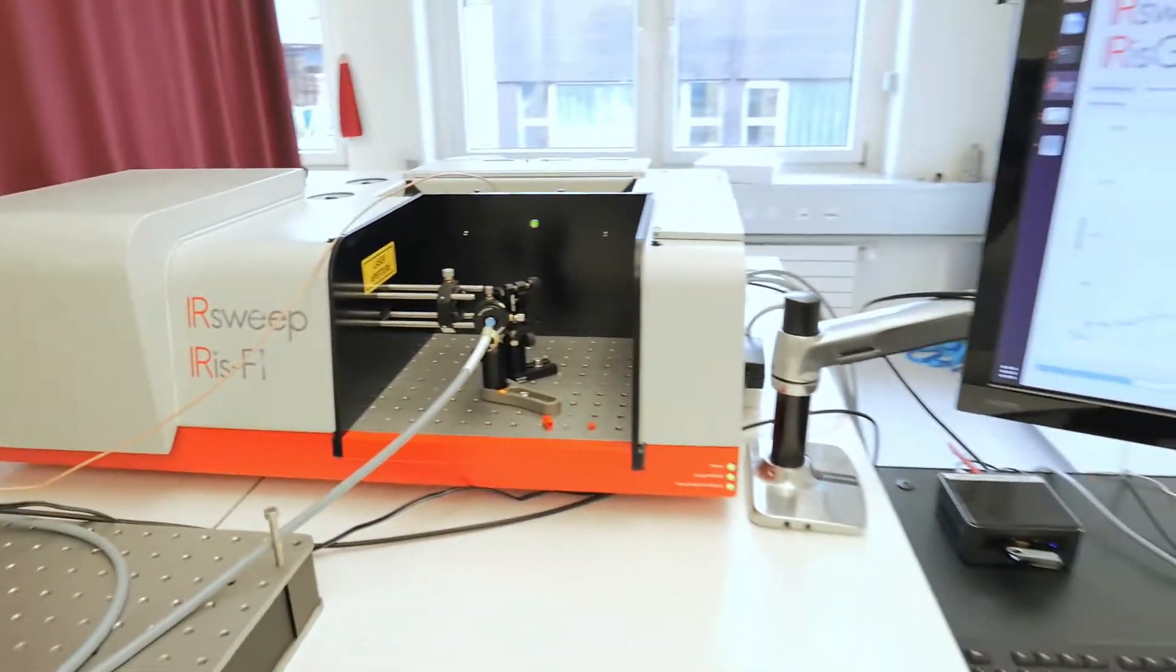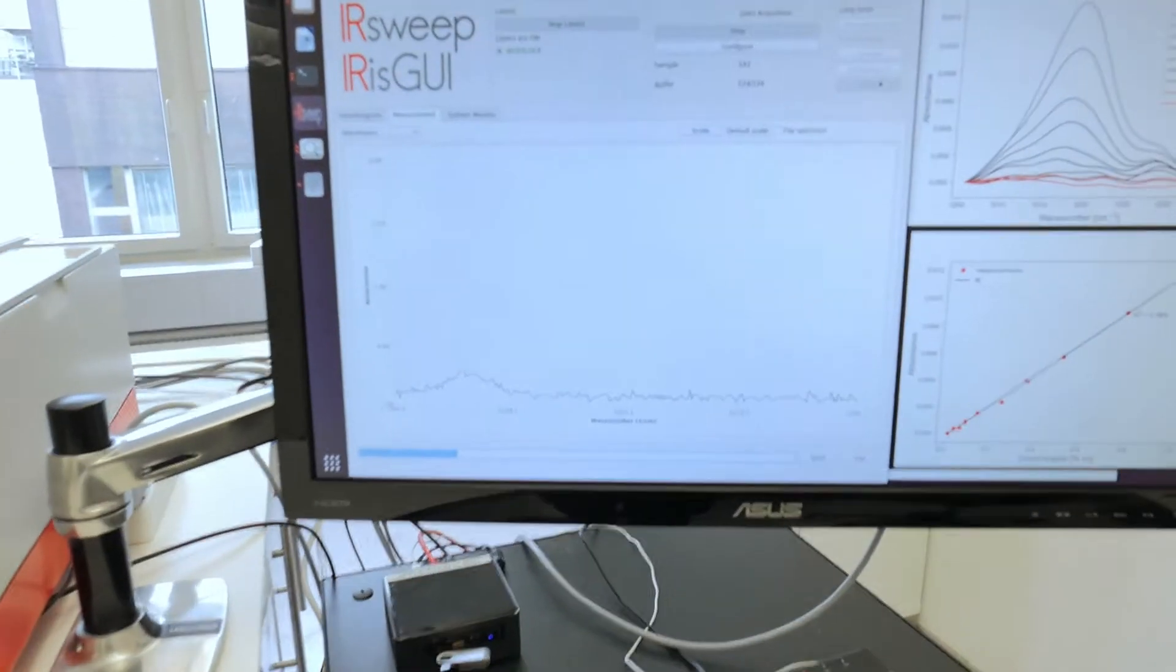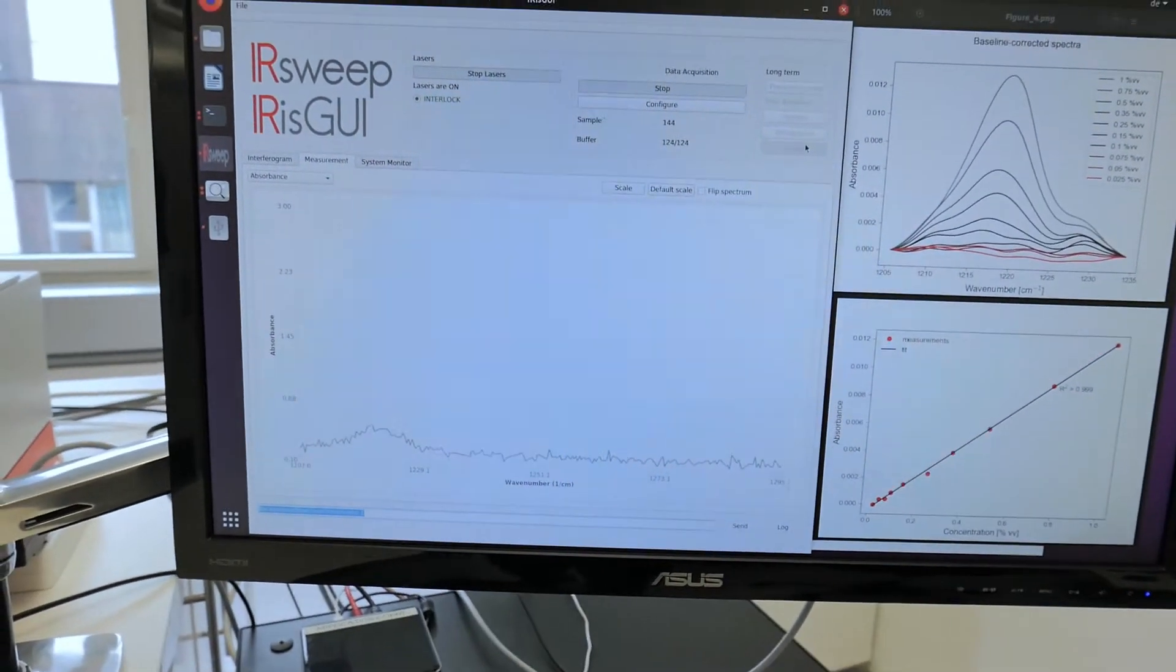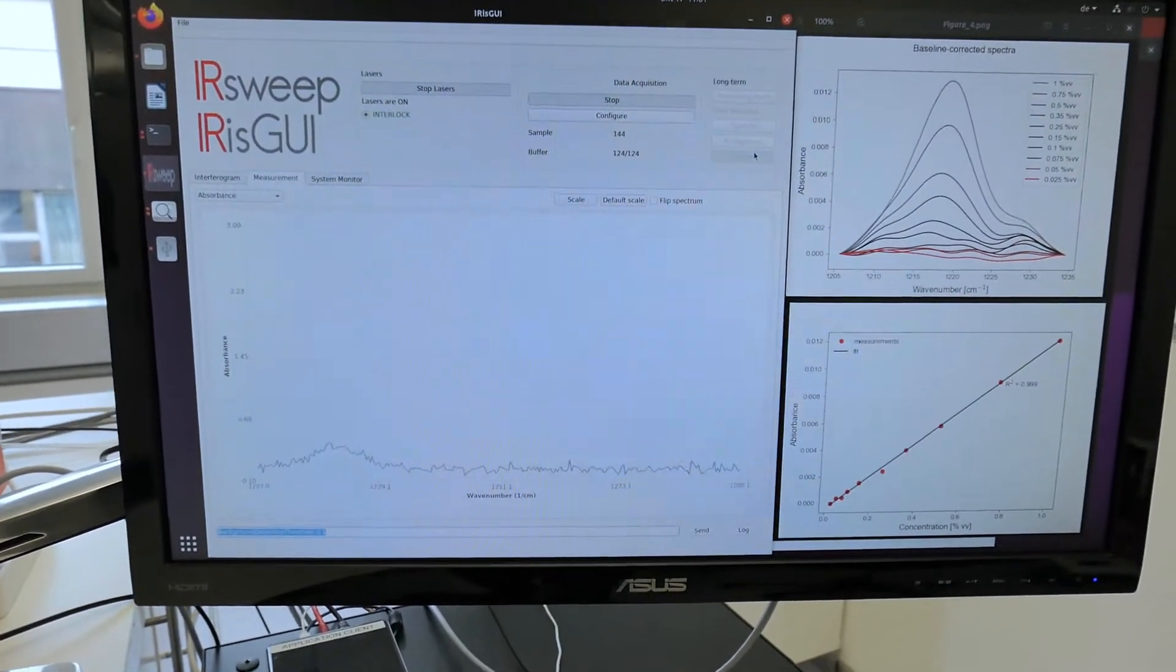Now there's actually a live measurement happening at the moment. As you can see at the bottom of the screen here, bottom left, it's updating it's a low concentration of acetone and toluene.